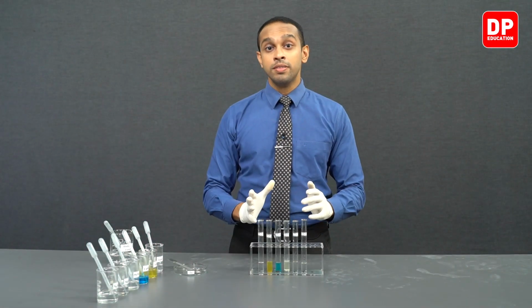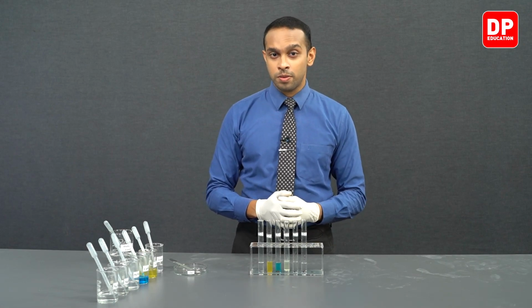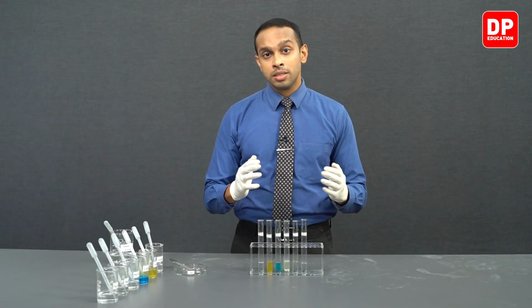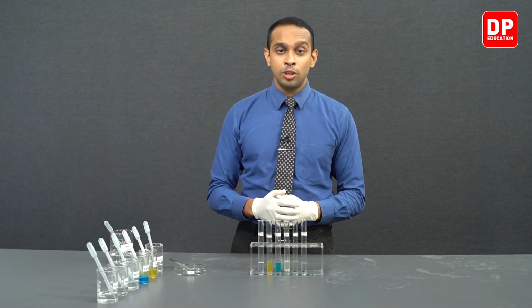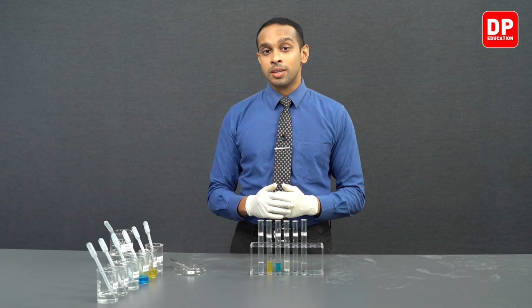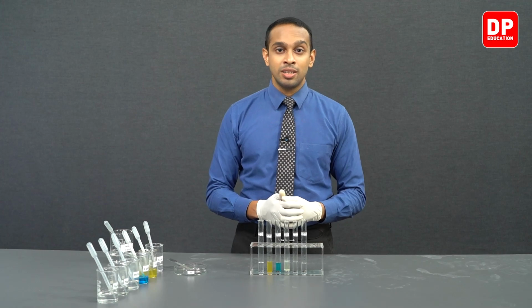Now students, we have allowed zinc metal to react with these aqueous solutions for a while, around 10 to 15 minutes. Now keep in mind, in the lab, if you do not observe a very clear observation within this given amount of time, you can first observe whether the metal surface is clean, and you can proceed to clean the metal surface and then proceed to do the same reactions again. And if the metal surface is also clean and still you don't observe reaction, to speed up the reaction, you may heat the solutions. But keep in mind, before heating the solution, if the metal surface is not clean, you will not obtain a reaction.